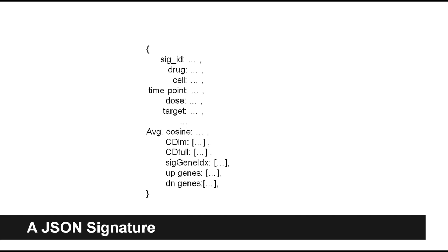So my second question is, can we download a certain subset of level 4 data, for instance, all the data for a single cell? I think you cannot. They provide their data in a big matrix. But they have scripts. After you download the whole data set, you can use their script to select a subset of data. Okay.